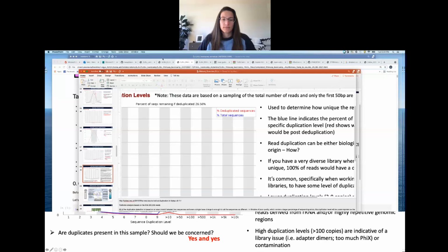I did want to put it in your heads so that when you sleep on it, hopefully some of the information will get transferred into your long-term memory. But yeah, we'll definitely start first by going over the issues with the template orientation, so the strandedness, and then we'll get into duplication. And then I have about 5 more slides before we'll start playing around with the Jupyter notebooks and start analyzing the data.